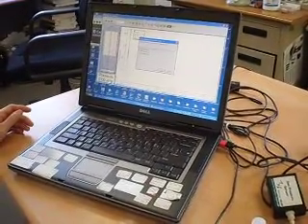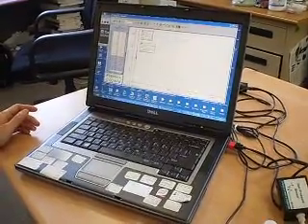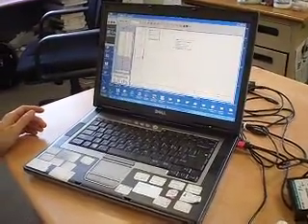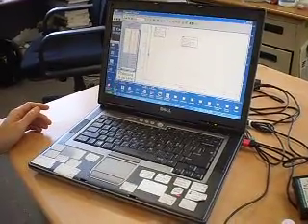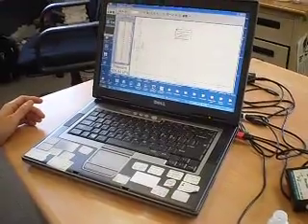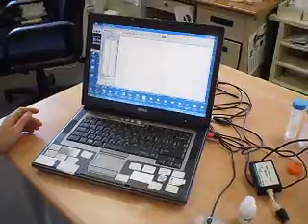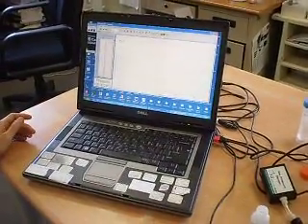Find my first run. Click on OK. This will be my first run down here. First run. Okay, stop.